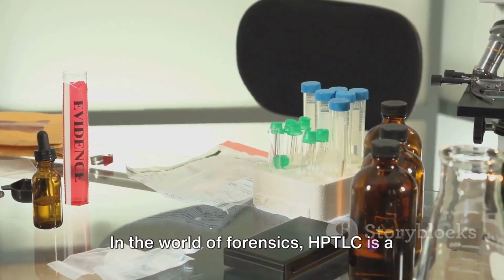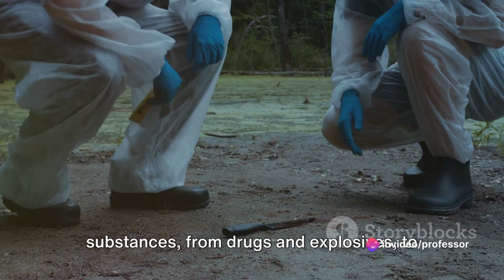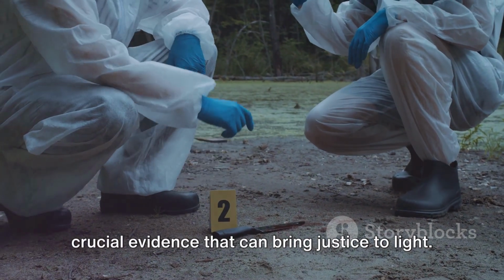In the world of forensics, HPTLC is a detective of sorts. It aids in the identification of various substances, from drugs and explosives to ink and dyes. It helps unravel the truth, providing crucial evidence that can bring justice to light.